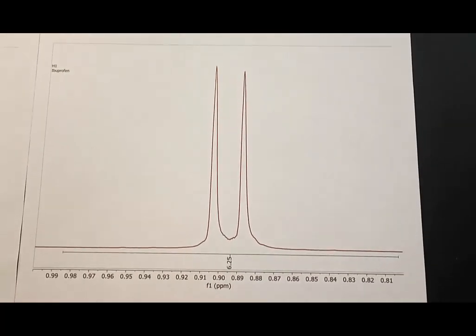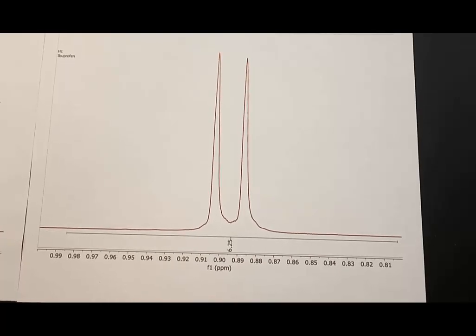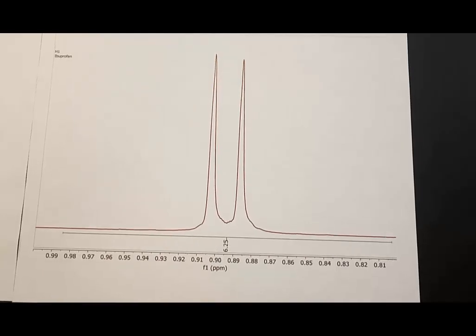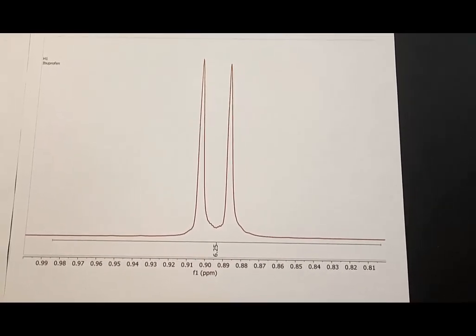This might strike you as strange, but before computers were a significant thing that we used all the time, this was something that you actually had to do. I personally have cut paper out and weighed it to determine the area under a curve. Be grateful that we no longer have to do that.